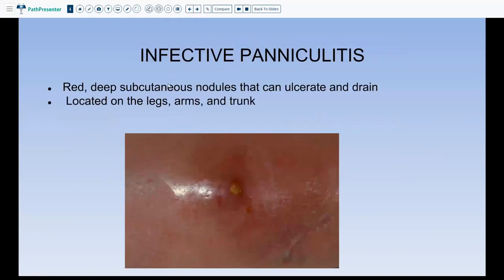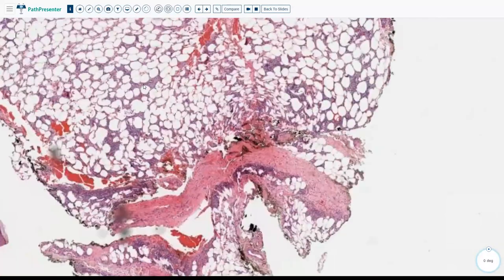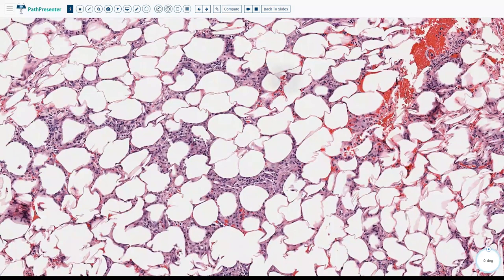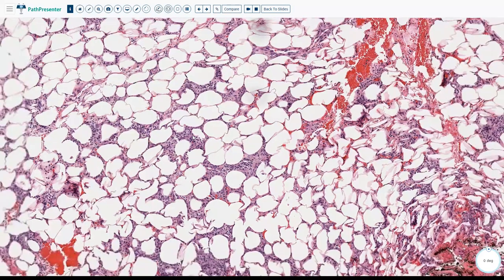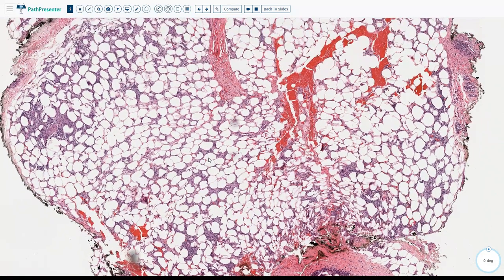The last neutrophilic paniculitis to remember is infective paniculitis, presenting with red deep subcutaneous nodules that can ulcerate and drain, located mostly on the legs, arms, and trunk. On biopsy you see a very dense neutrophilic infiltrate in the lobules. You must do all your stains — gram stain, fungal stain, AFB — to rule out infection. If no organism is seen, you still recommend culture and a clinical-pathological correlation with culture results.